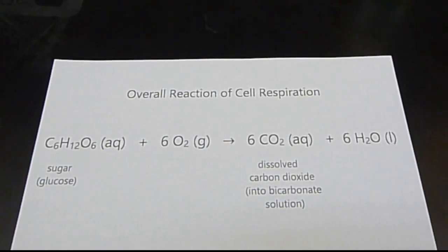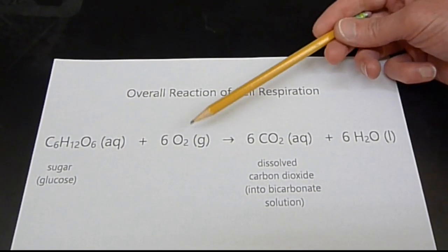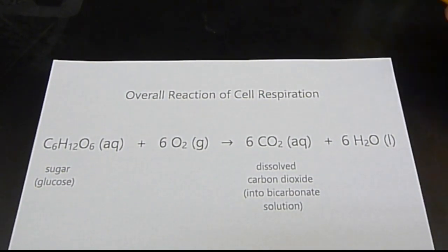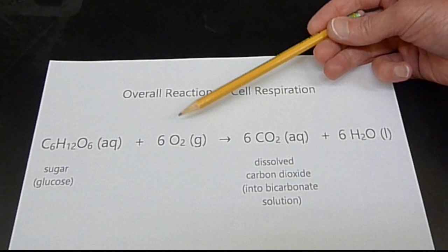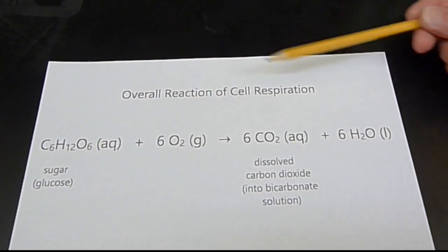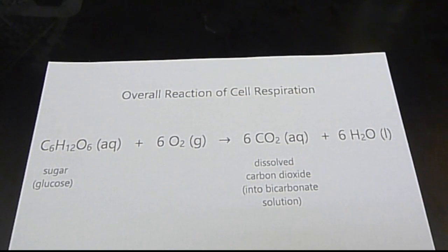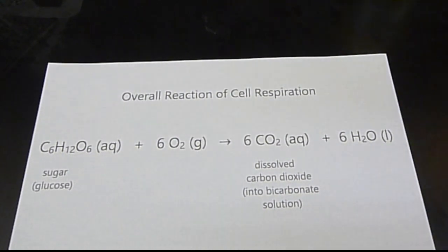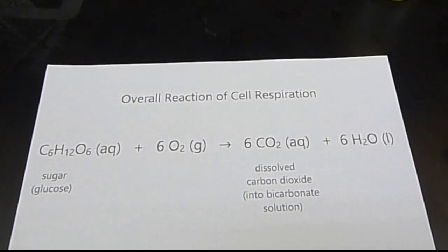Photosynthesis produces oxygen. Cell respiration will be using some of that oxygen up. So what we're going to have to do is kind of subtract out, or really add back in, the quantity of oxygen consumed by cell respiration. So there is a variation of the theme. I'm going to put Elodea in the same tube, run the experiment again, but then wrap it in aluminum foil to keep it in the dark.